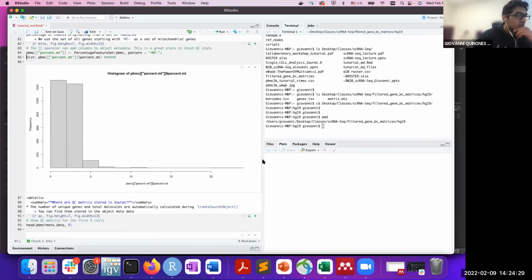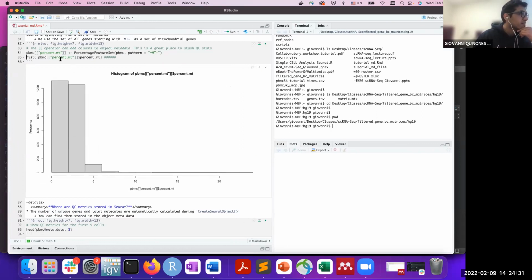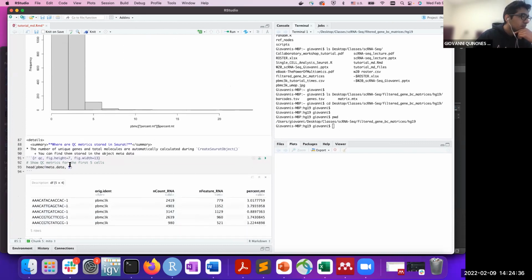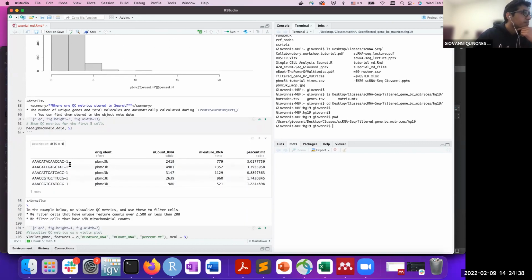Okay, hopefully everybody's done running this cell. We can move on to the next one, which is just going to print our data table, the first 5 rows. This is just to show you the values that we're using here.